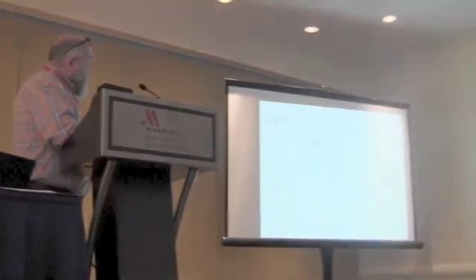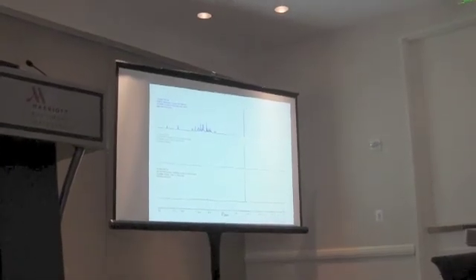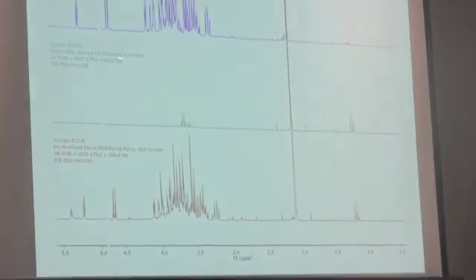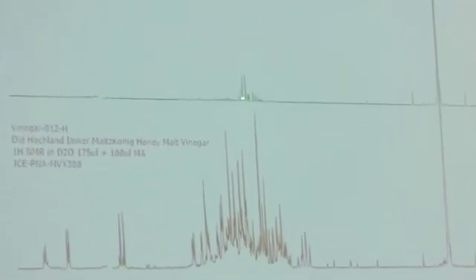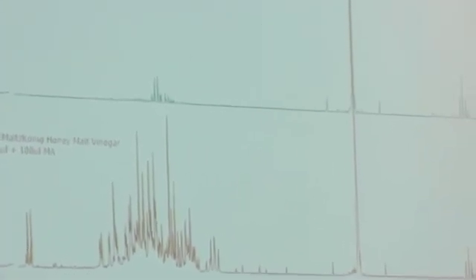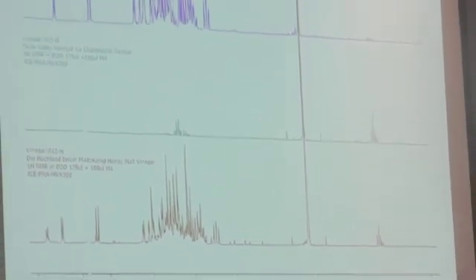And then you could look at vinegars. The TTB are interested in this because vinegar has a lot of volatile acid, and it really throws off that near-infrared analyzer. You can look at whether there's a lot of sugar in vinegars or not. This is a Napa Valley vinegar company, so I'm not even sure what that is. There's a ton of stuff in here. When you really go into the baseline, there's lots of molecules that look really interesting, but I don't know what they are.